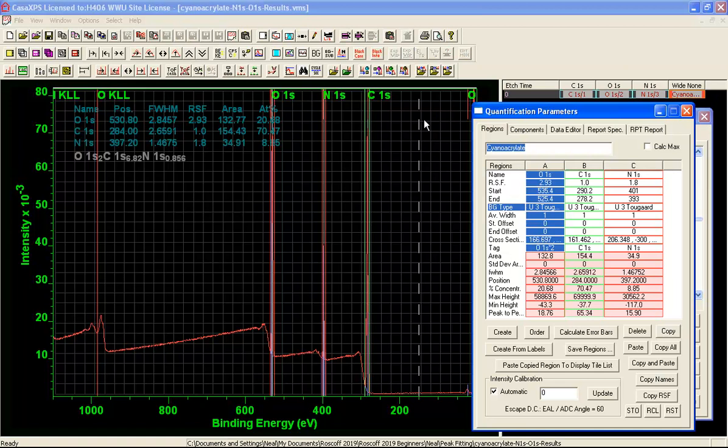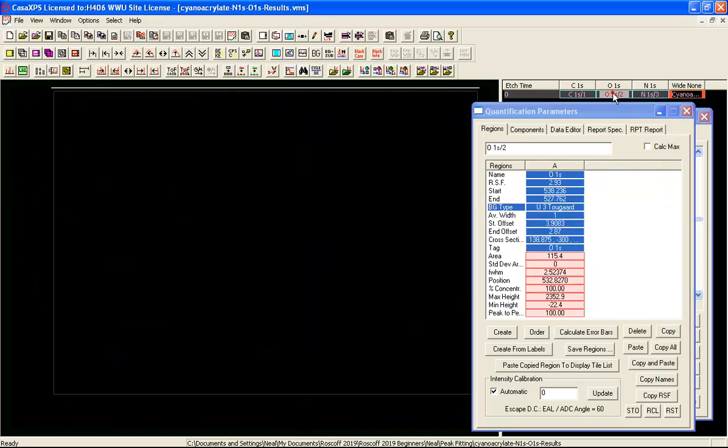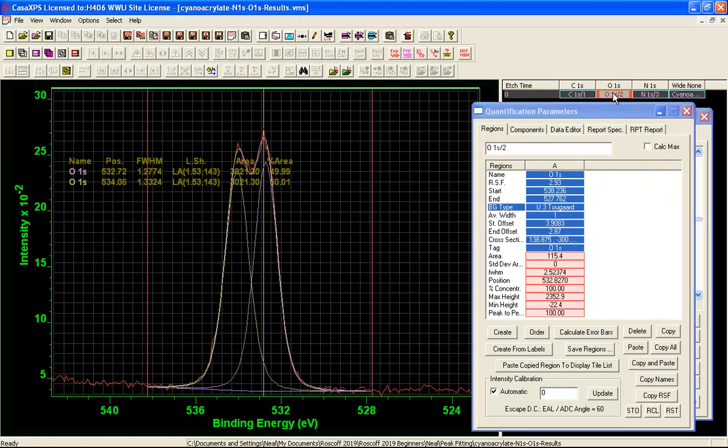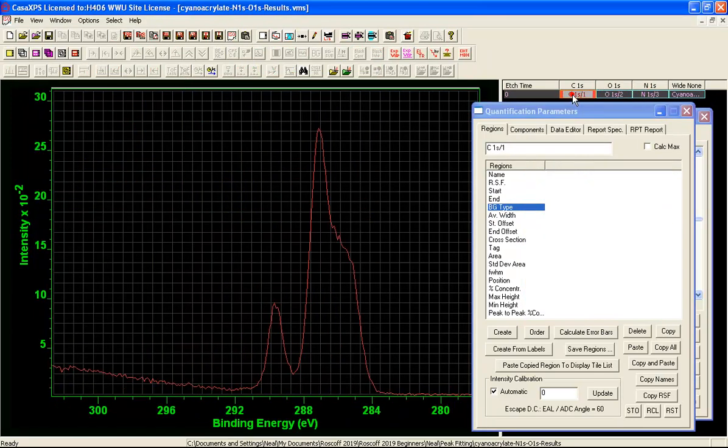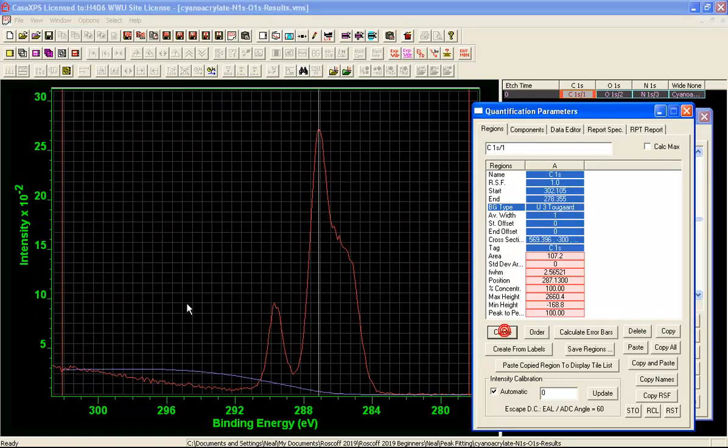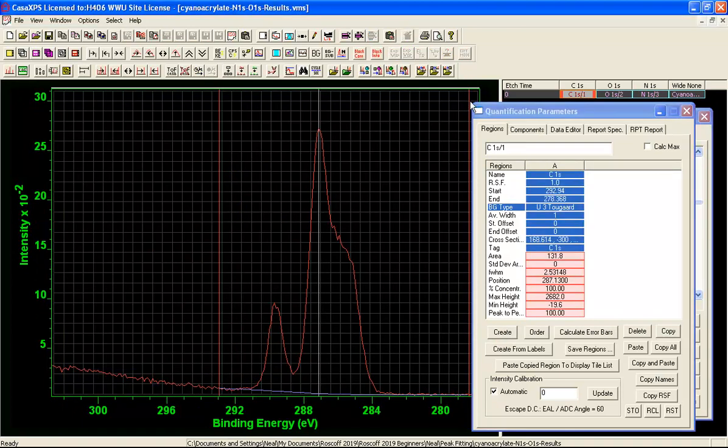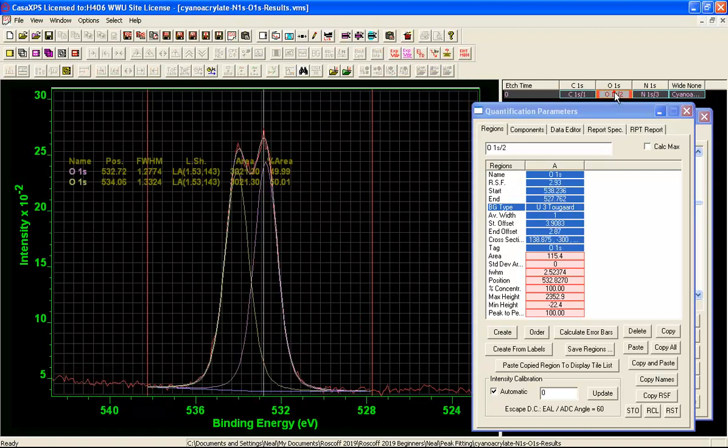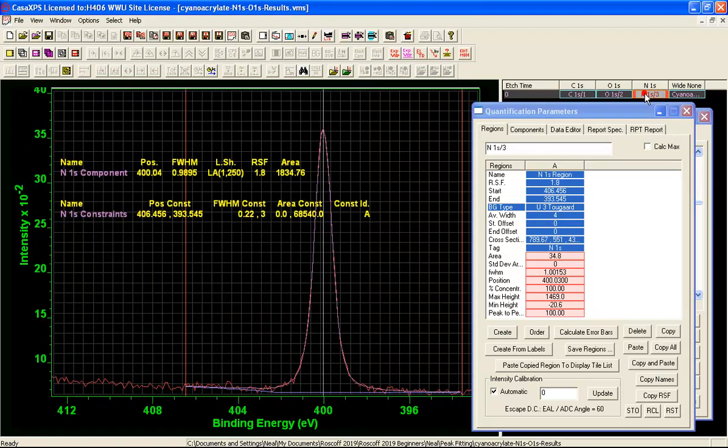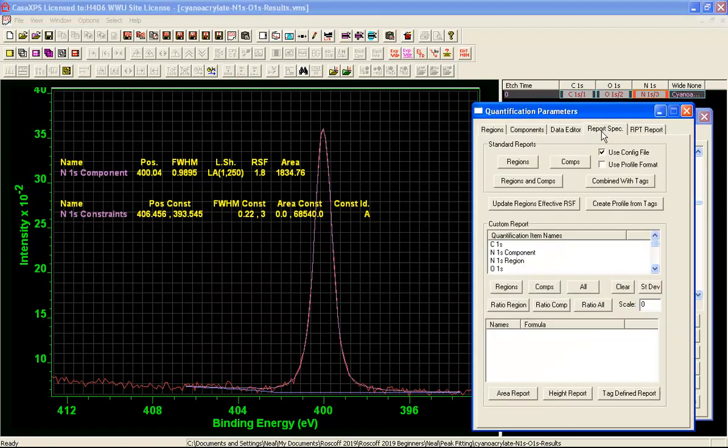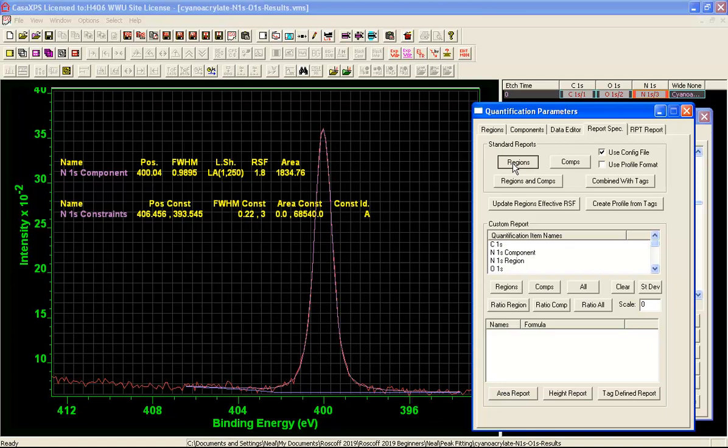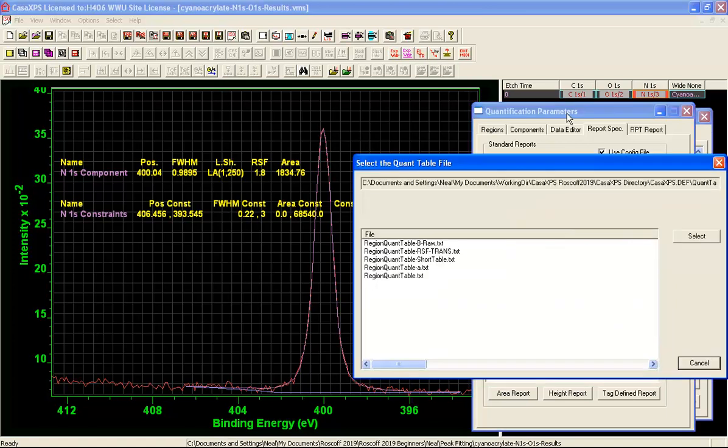As an alternative to looking at a survey quantification we could look at the high resolution data. And we have already performed a peak fit here. So what we need to do is create a region for the carbon. And once we have got a region, since we already have regions here and here, what we can do is select these and on the report spec property page we will use a standard report and just perform a quantification based on regions using these selected high resolution spectra.